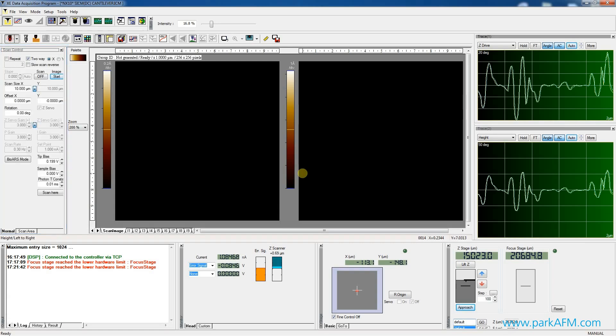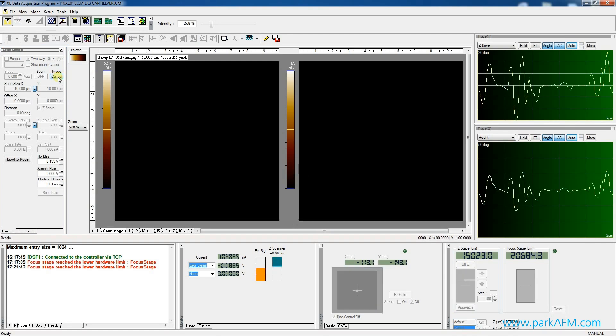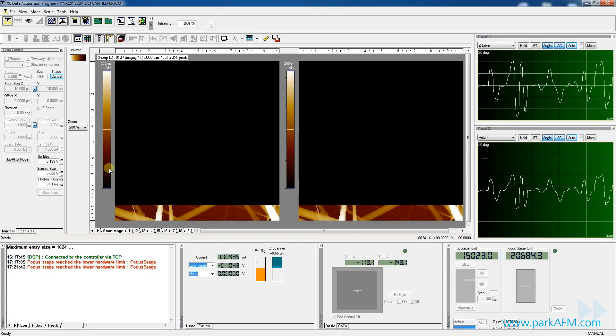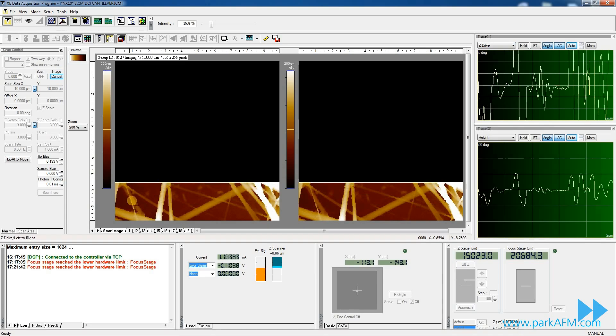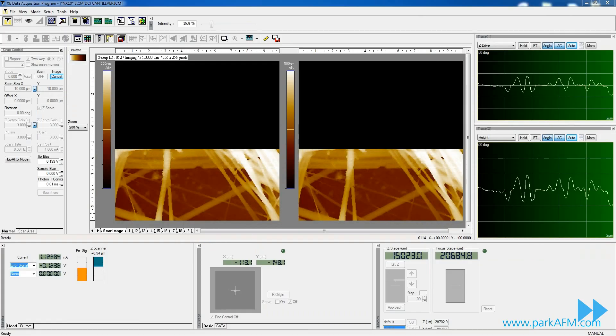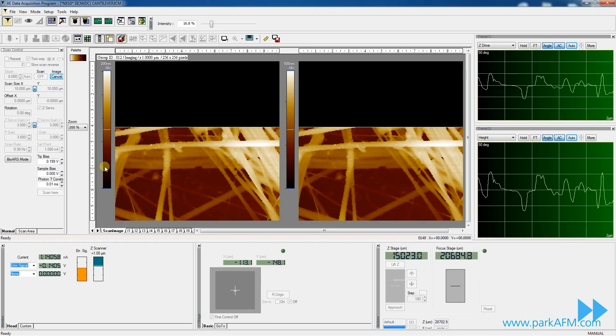Now, let's begin scanning the collagen sample. To save time, we have sped up the footage and now here is the completed SICM image of the collagen sample.